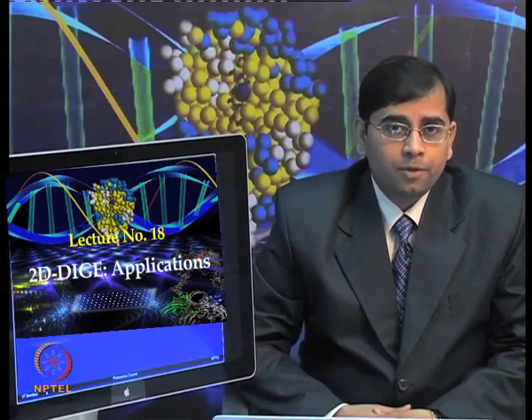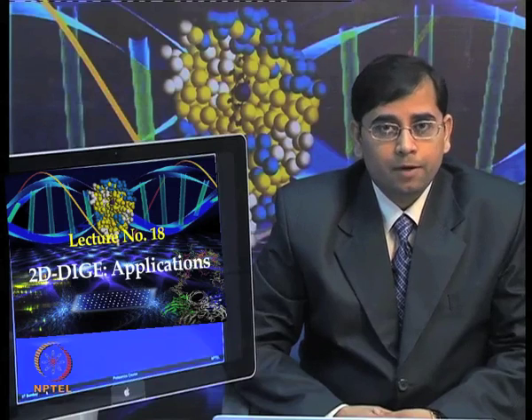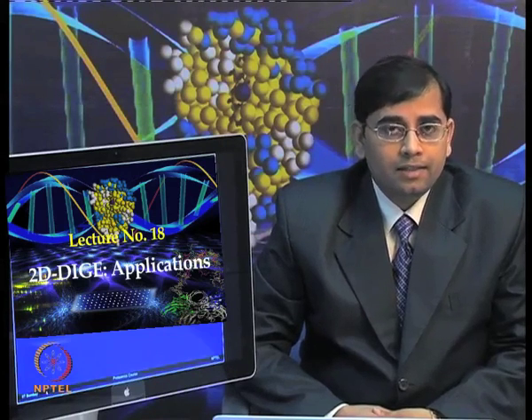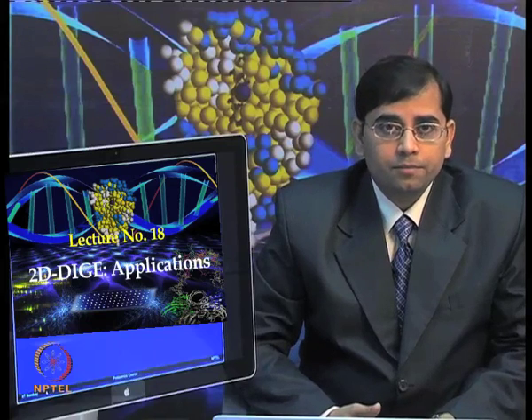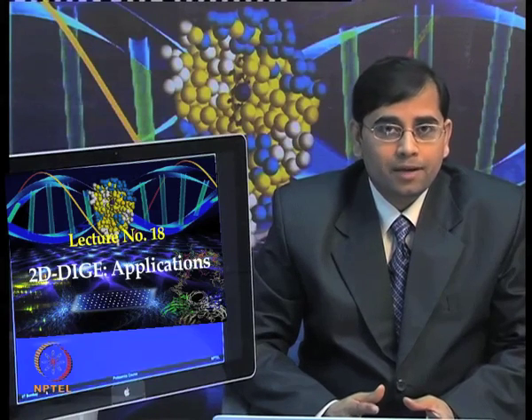I hope that at the end of this module and lecture, you will be able to perform a gel based proteomics experiment. But please keep in mind, these protocols and methods are only giving you a feel for performing these experiments. Each experiment, each sample type, each biological question brings its own unique challenges, and depending upon those conditions and your sample type, you need to optimize these methods. There is no one technology which can answer all of your questions, but it is a good idea for you to know what different methods are available for you to use.